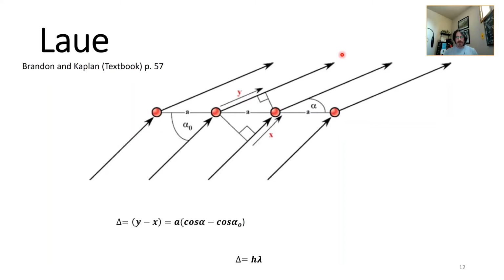So Laue came up with these equations. He realized that there's a path difference between the incoming and exiting X-rays. He was doing this work with X-rays and different materials or crystals that he found, and created this so-called triangle math. And you see our repeating theme of triangles.